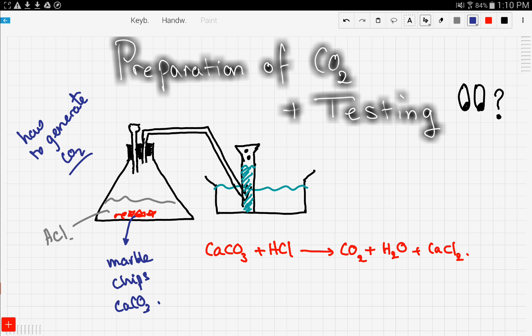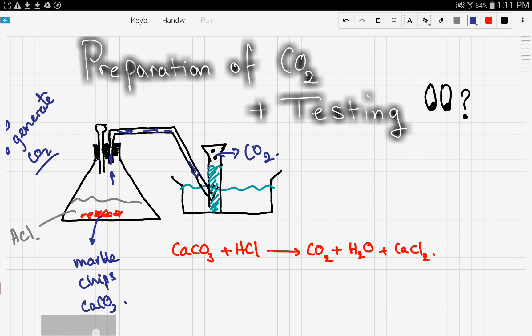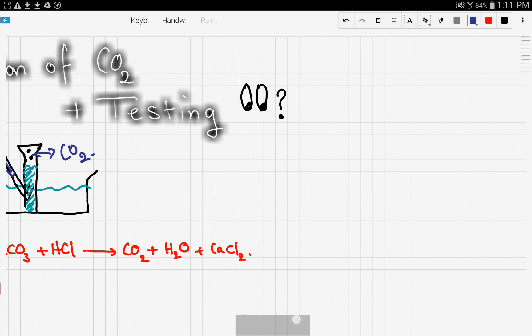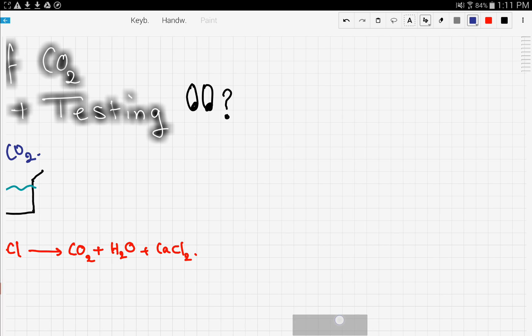The carbon dioxide generated travels up through the pipe and into the water. We can see bubbles being generated — these are bubbles of CO₂. Now, how do we test for the presence of CO₂ and confirm that the gas is indeed CO₂?